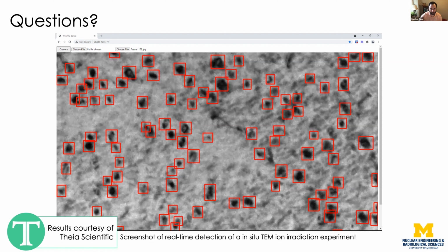Okay, and we have a question from Jeremy. Does it take a lot of RAM capacity if you run the in-situ experiments and the YOLO algorithm simultaneously? Yeah, I don't want to give the secret sauce for that quite yet. But what I will say is that YOLO takes just under 4 gigs of memory to run. But the way we are doing it is not running both on the same computer. So the hardware limitations are a consideration.